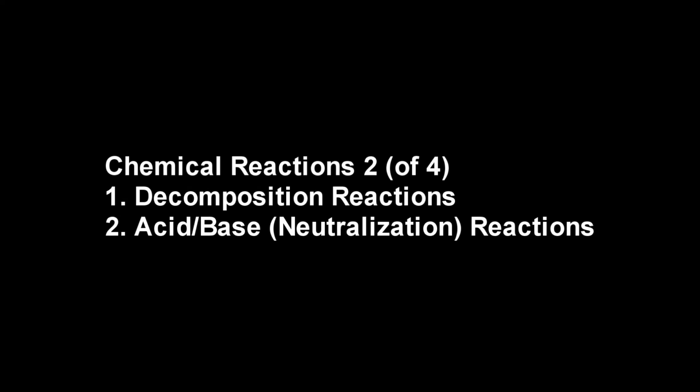This is part 2 of 4 chemical reactions video experiments. In this video, we'll be studying decomposition reactions and acid-base reactions, also known as neutralization reactions.